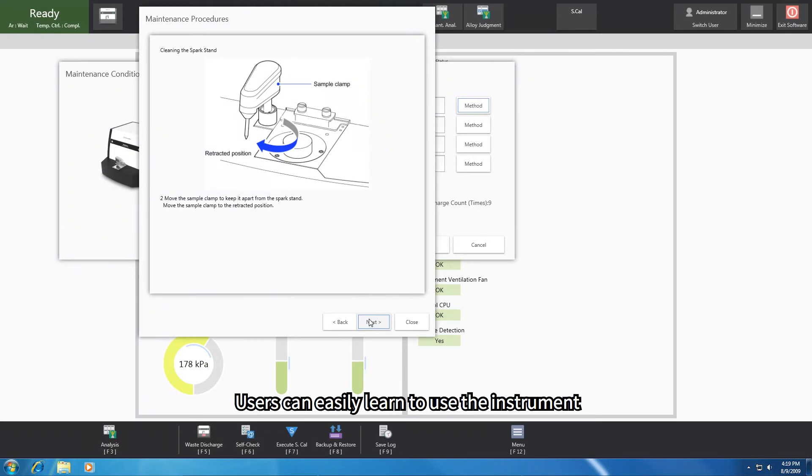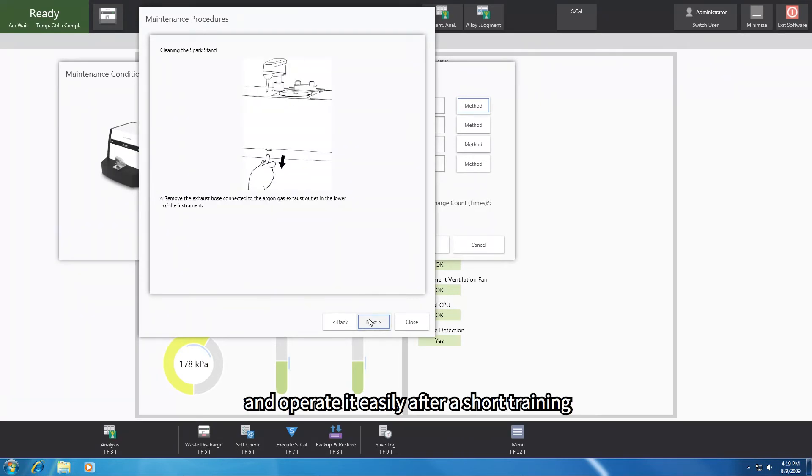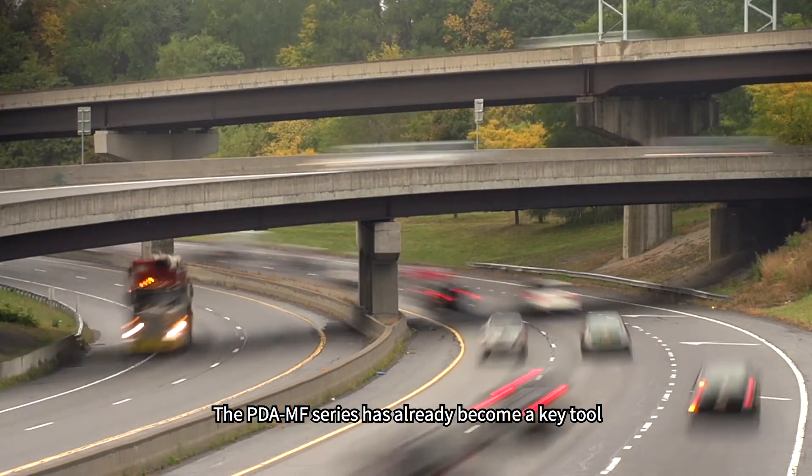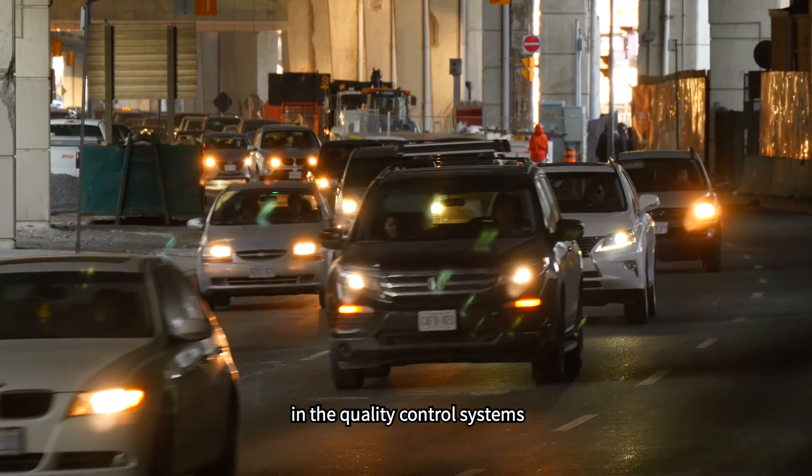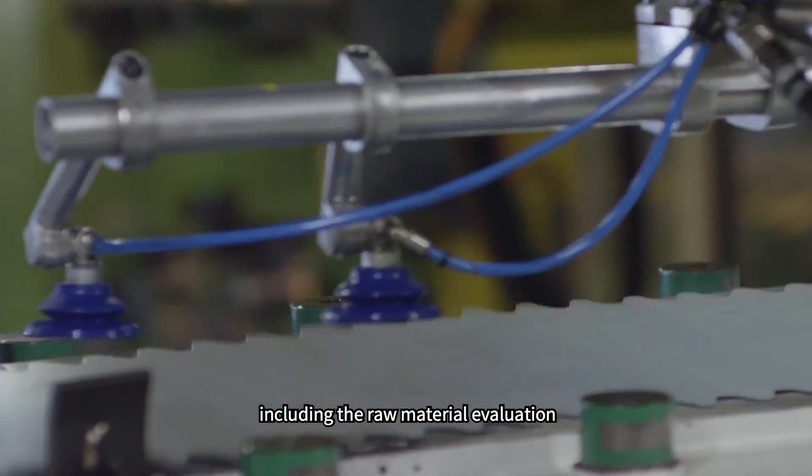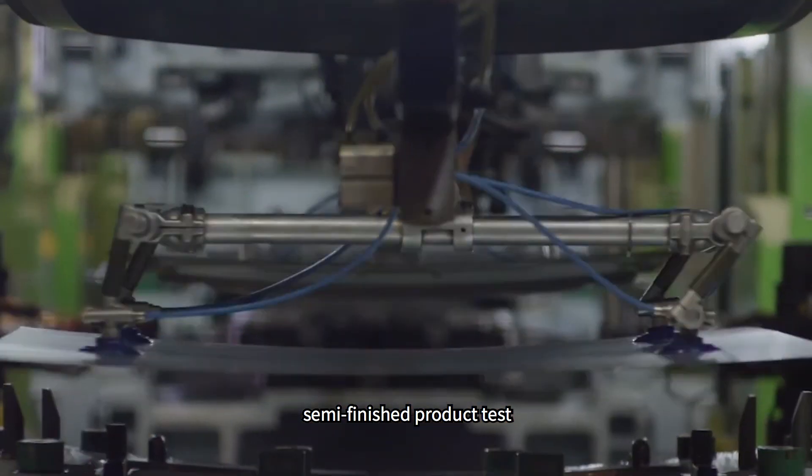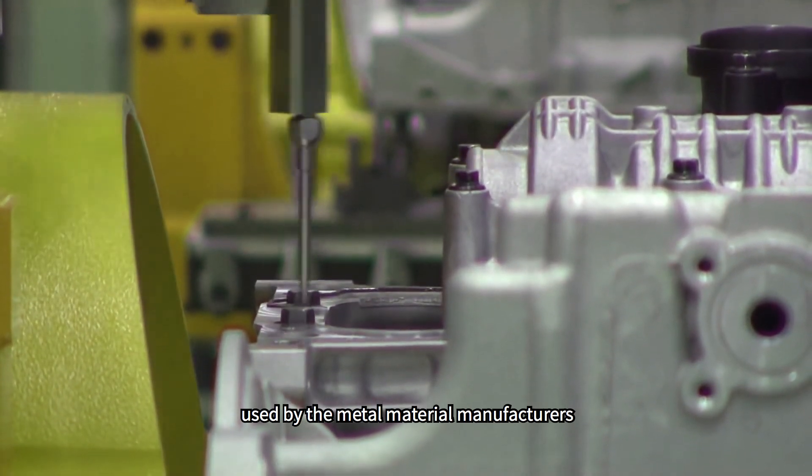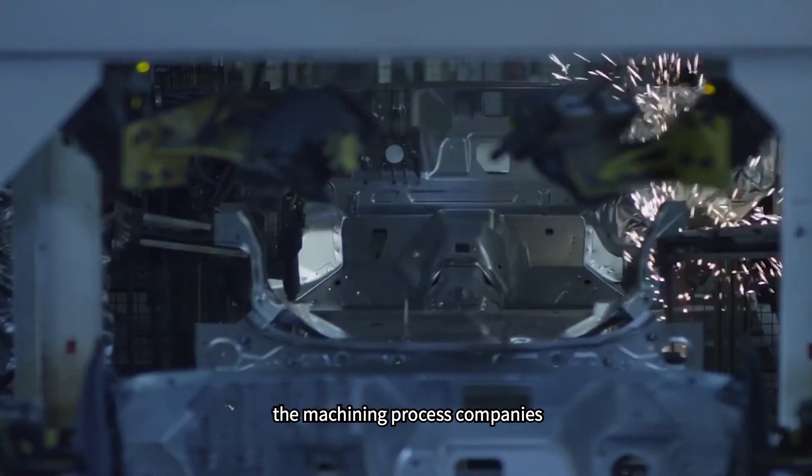Users can easily learn to use the instrument and operate it easily after a short training. The PDAMF series has already become a key tool in the quality control systems, including the raw material evaluation, semi-finished product test and finished product re-inspection used by the metal material manufacturers, the machining process companies, as well as the third-party inspection organizations.